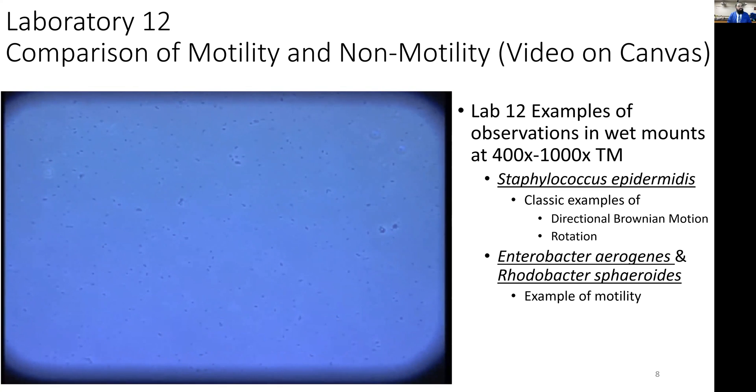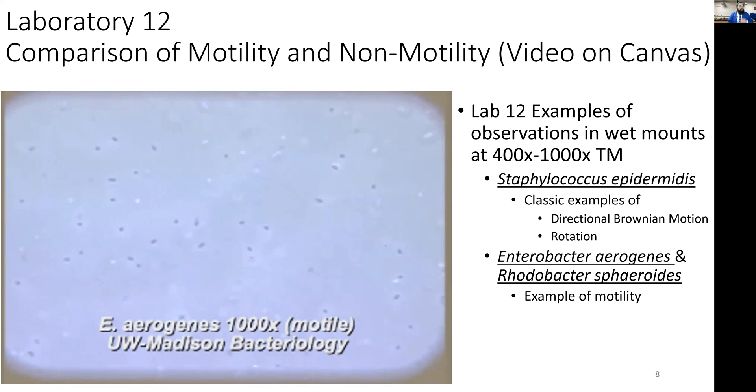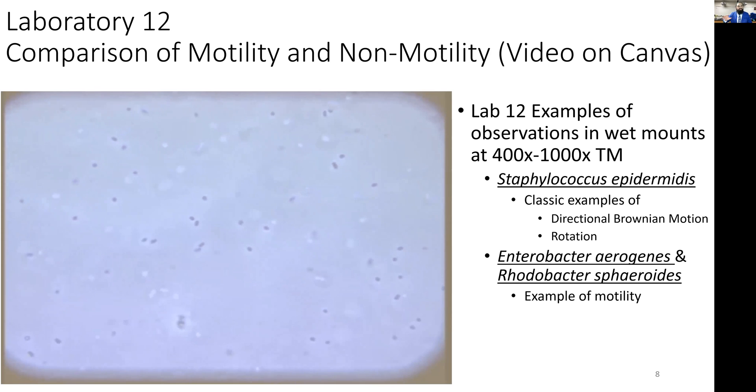Now here's a different organism—Enterobacter aerogenes. Even though you observe a little Brownian motion, you can see the organisms are truly moving around within their own area. They bounce around and go back and forth, not all being carried in one specific direction. If you zoom in, you see them traveling, changing directions as we go. A video of this from YouTube is available on Canvas as a reference.